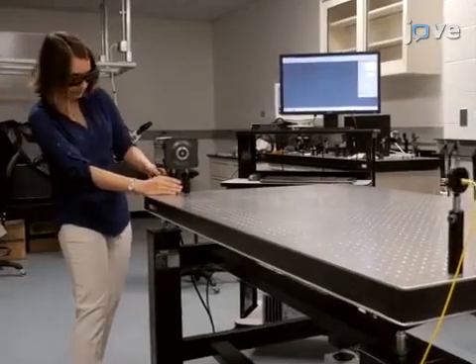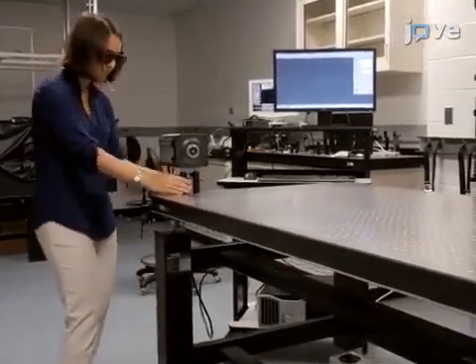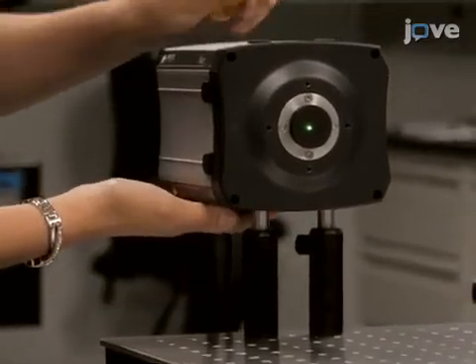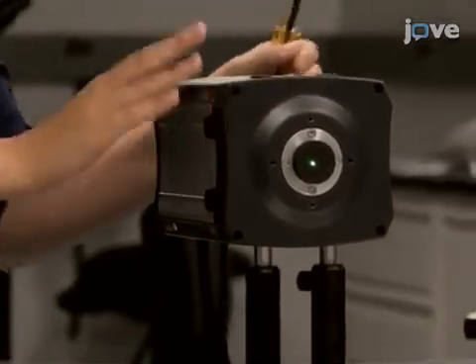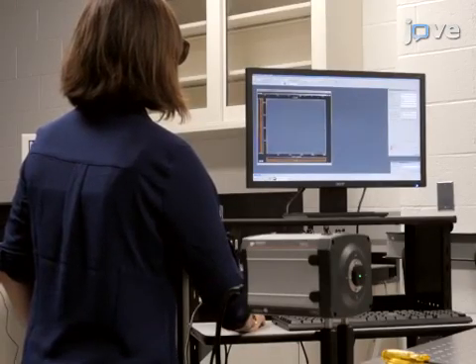Begin with a camera and optical fiber in position on an optical bench. An EMCCD camera is mounted at one end of the optical path. The camera should be acquiring images and displaying them on a monitor.